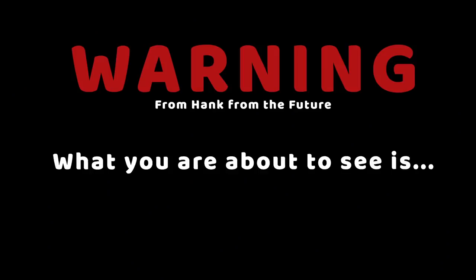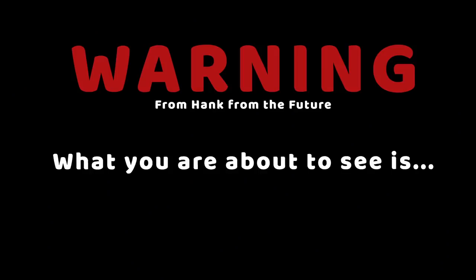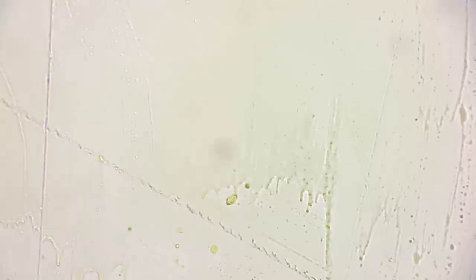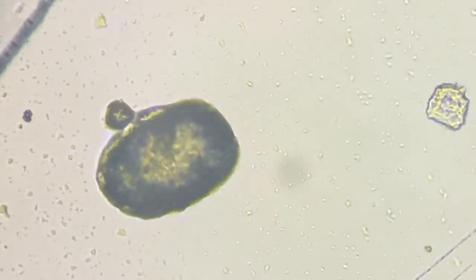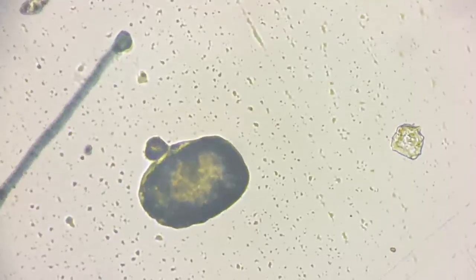Warning from Hank from the future: what you are about to see is not great. Oh — green. Why is it green? The mucus. Okay, well, there's a big something. What's that? Why is it a color? Those are all just like individual little dots of grease.